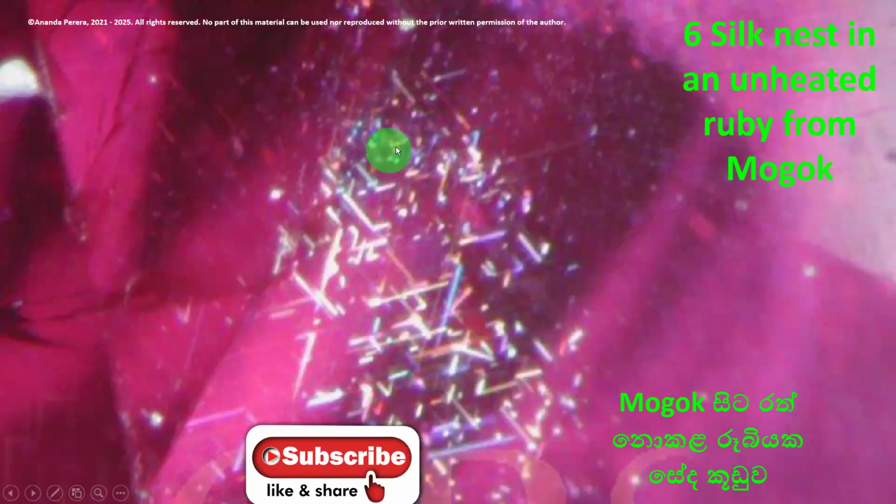Now we are moving to next. Here, it is natural ruby. You can identify this as silk, 60 degrees and 120 degrees angle. Can you remember? So silk nest is here. It is unheated ruby. So we can see it is unheated ruby. Nothing happened by the heat. Silk nest in an unheated ruby from Mogok.